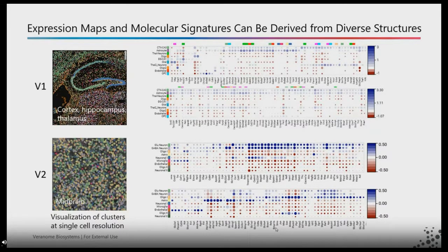So right away with the panels, we're able to get really clear distinctions on cell type just by looking at the detection rate, which is indicated by the strength of those dots. So the smaller dots indicate lesser expression and a lower detection rate on a per cluster basis versus really large dots, which are cells that have very high detection rates.